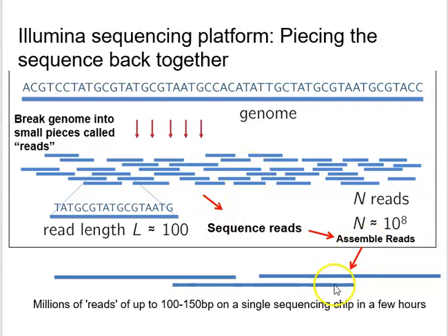And we try to get a read depth. If you get a read depth of 10, that means that each base has been read 10 times on 10 different sequences. So if we went up here, let's say whatever base that is there, it's been read once, twice, three, four, five times. So that would be a read depth of 5 for that particular sequence. And the deeper the read depth, the more accurate the sequencing is likely to be. So that's what it's done.